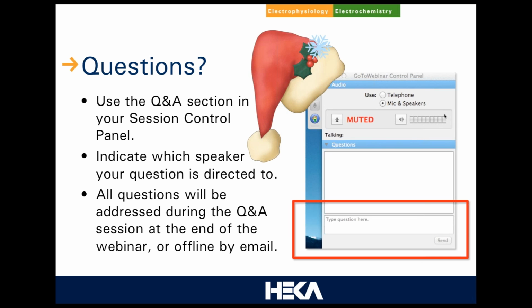So, Telly, yes, a question addressed to you. I mainly work on studying the action potential from stem cell-derived cardiomyocytes when I try to pace the cells at fixed frequencies, so 0.5, 1, and 2 Hertz via recording pipette. I sometimes cannot capture it very well. How to get a better pacing by recording pipette?